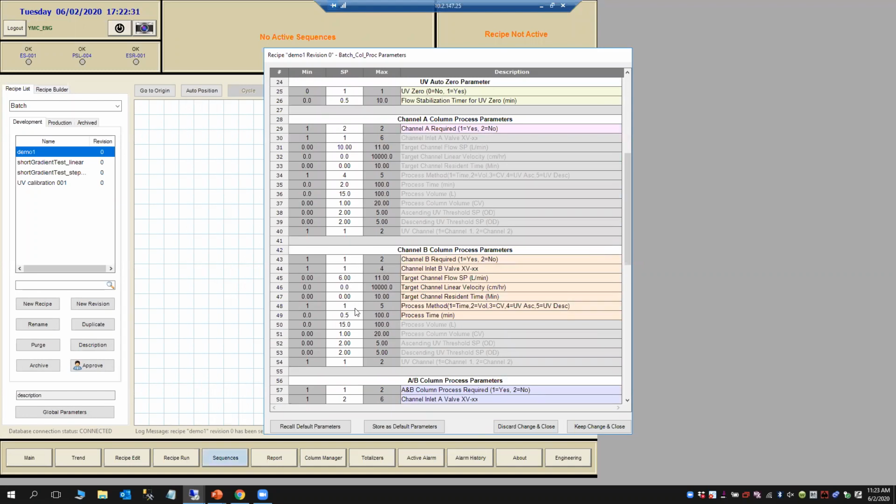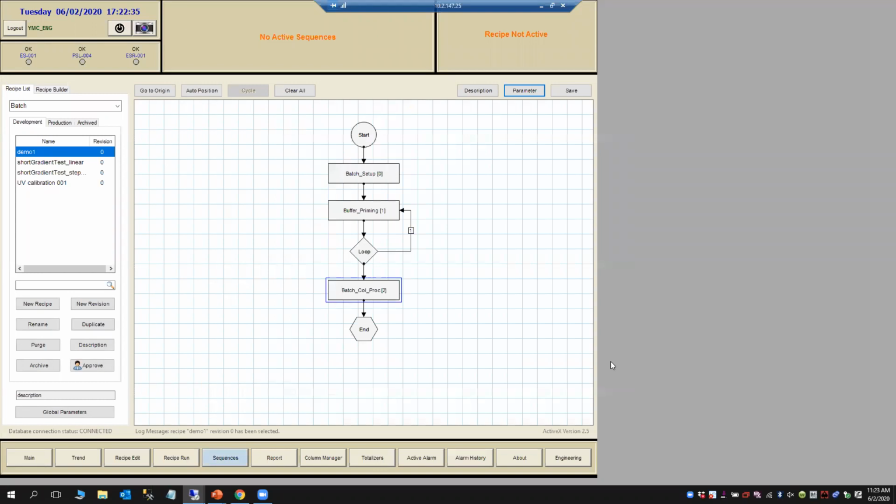We have made certain selections and it looks like everything has been saved correctly. So this is again a good demonstration of how safe the system is in terms of the database storage and the backup.